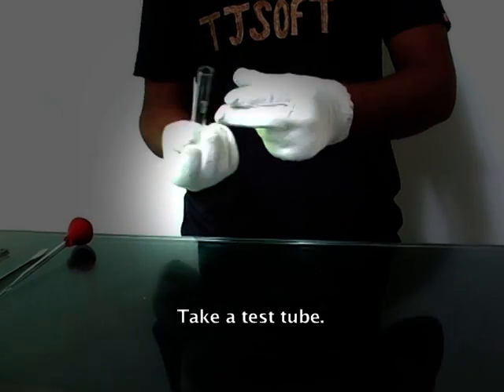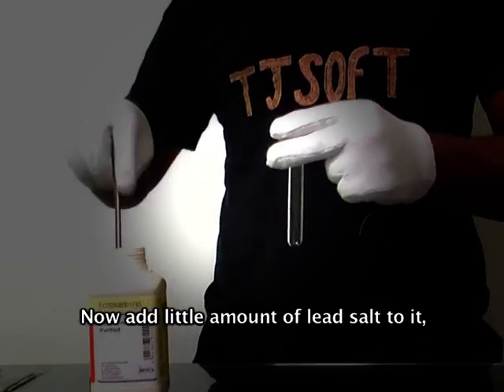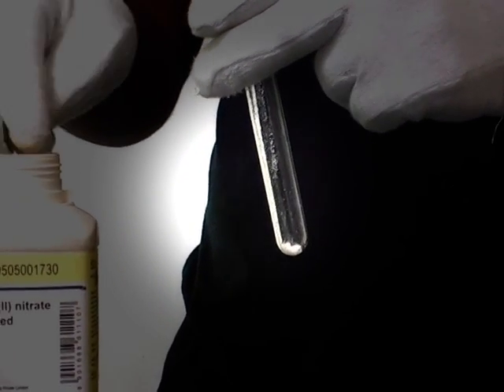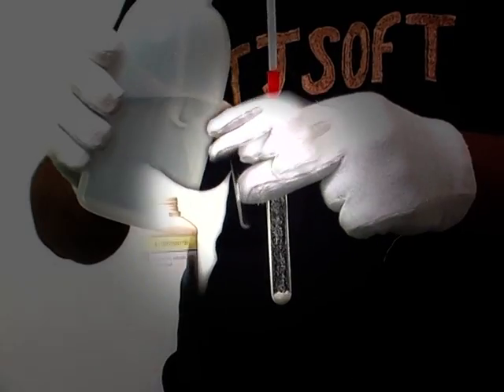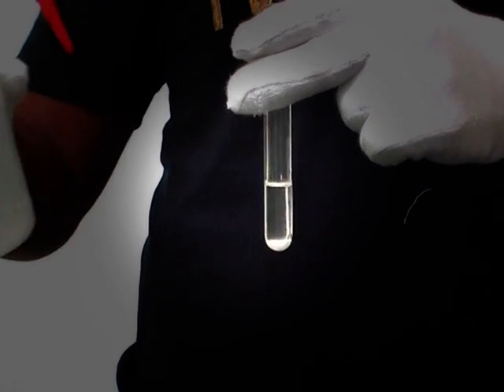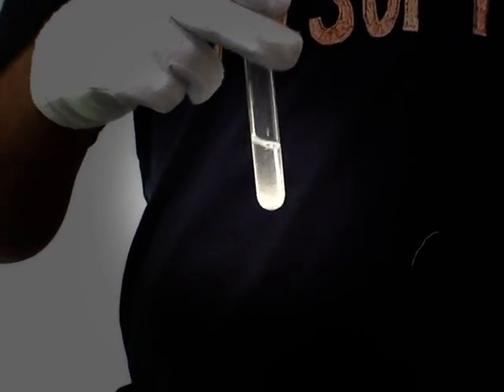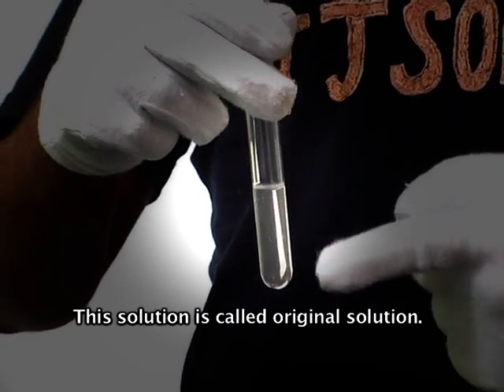This is the first time I'm going to show you how to do it. Take a test tube and add a little amount of lead salt to it. Now add cold distilled water and mix it well. This solution is called the original solution.